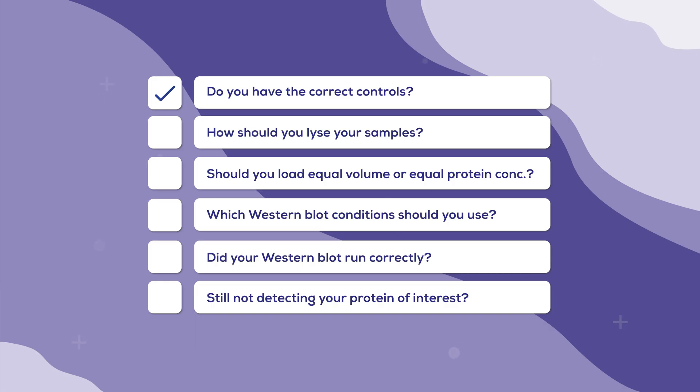Now, on to sample preparation. Whilst it is more common to lyse EVs, some people report not lysing their EVs at all. But if EVs are still intact, it is hard to rationalise how a size-based separation technique like Western blots would work. Cytosolic proteins likely wouldn't be released, and membrane proteins may not travel the correct distance down the gel. So whilst some people appear to get good results using this method, we recommend starting your sample preparation with EV lysis.